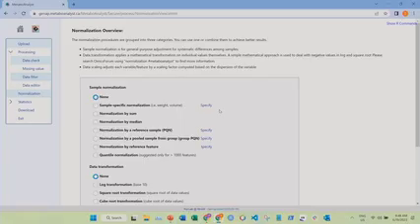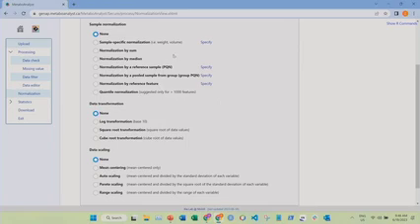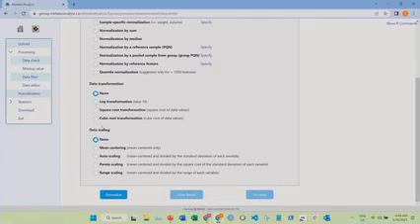You can also, instead of the variance, be filtering based on any of these other statistics. All right, so this is the normalization page. It's kind of scary because there are a lot of methods. They're organized into 3 groups. One is sample normalization. This is what I talked about before, where maybe we have differences between our samples related to their isolation or preparation. And so we perform sample level corrections that adjust the entire distribution of metabolites so that they're more comparable. The second one is data transformations. The most common one is log transformation. And then data scaling. And I'll show you what this all does.